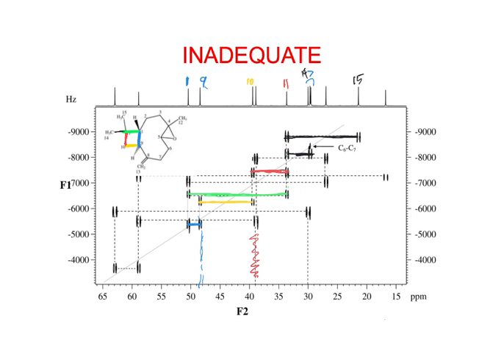Wouldn't 15 be the more... Yeah, no, 15 would be the more upfield one. Well, they're going to be like this, but you also have that proton sticking up from 1. Yeah. But I think it depends on how this whole thing is bent, and where they are relative to the double bond and relative to the epoxide and such. So I don't know if I did that assignment or if that was in the text already.